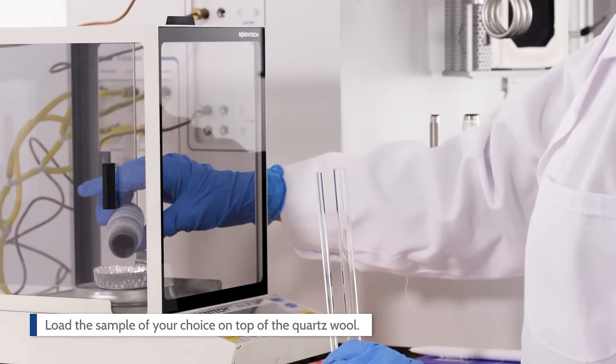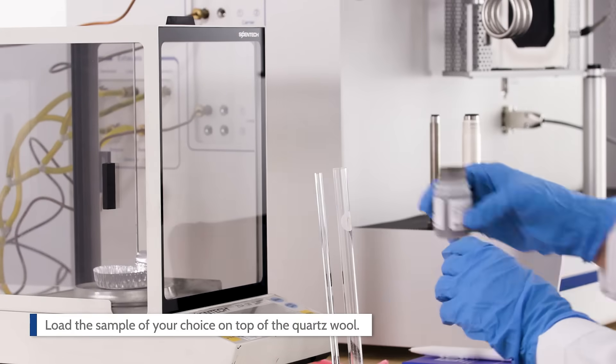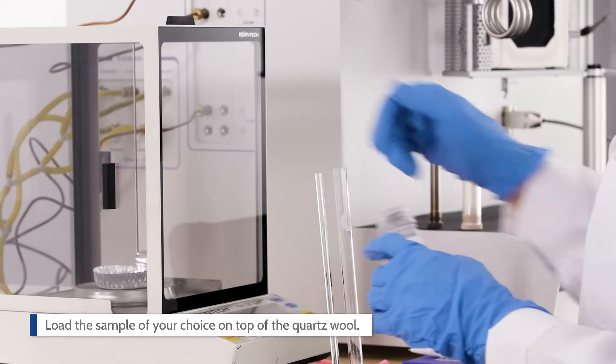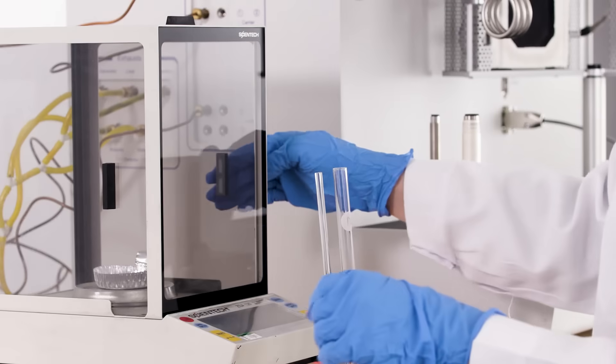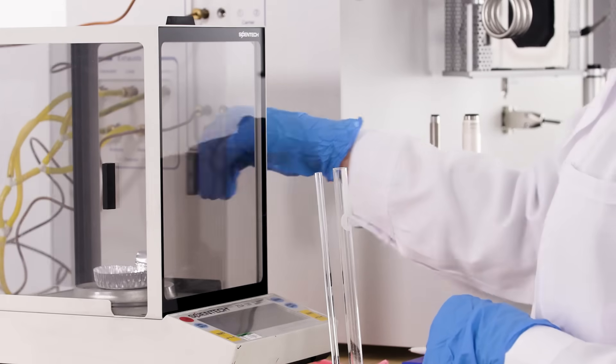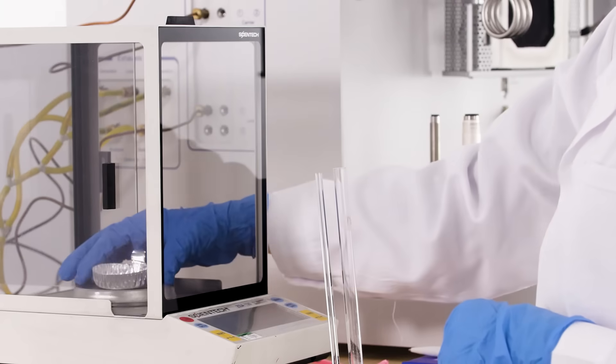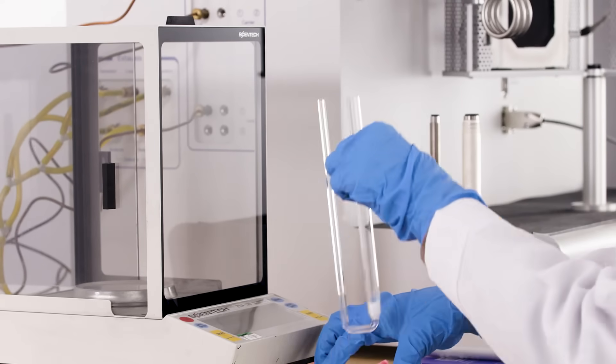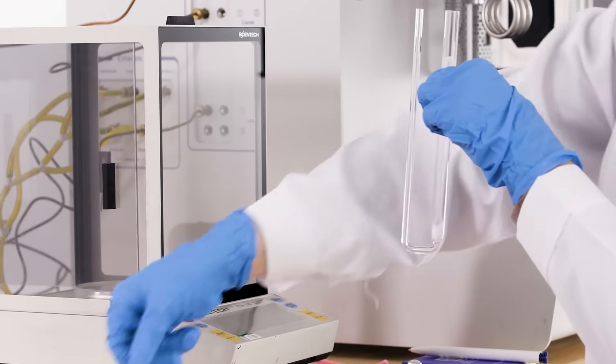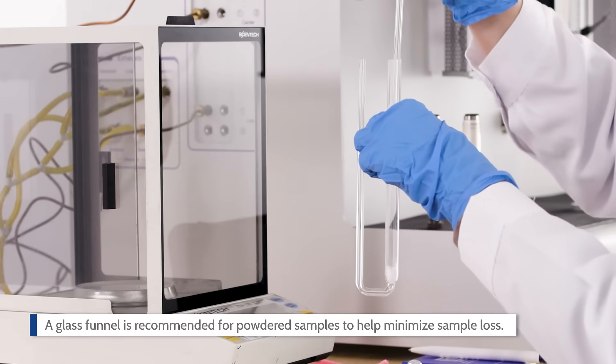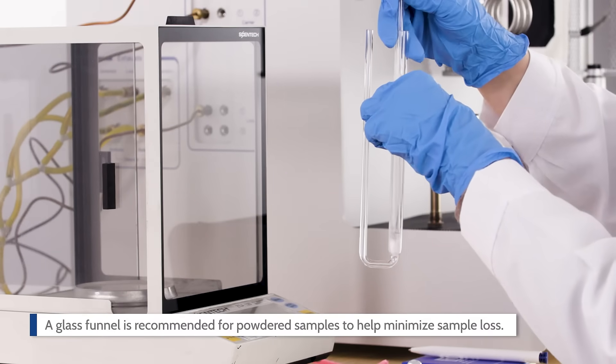Load the sample of your choice on top of the quartz wool. The sample tube can handle powders and pellets up to 9 millimeters in diameter. A glass funnel is recommended for powdered samples to help minimize sample loss.